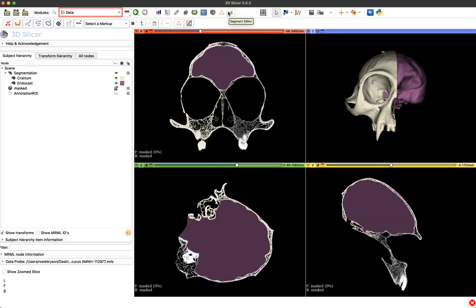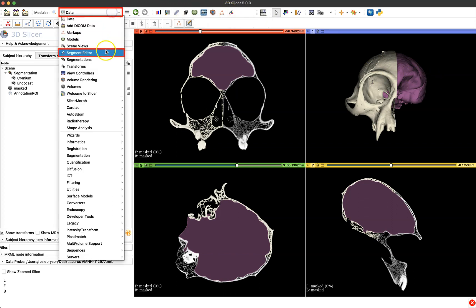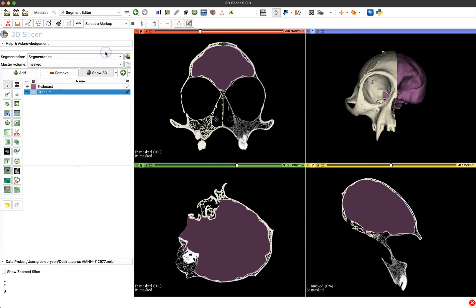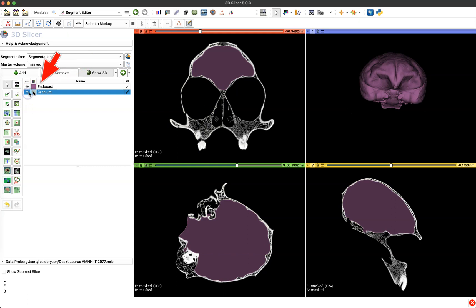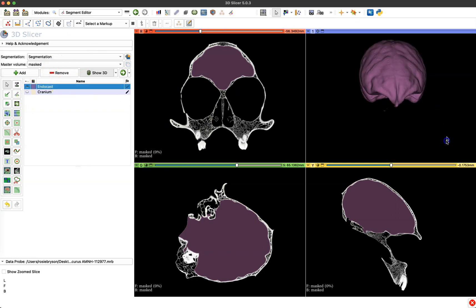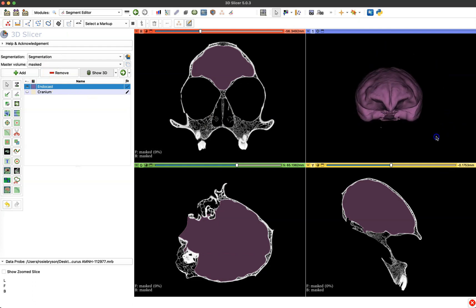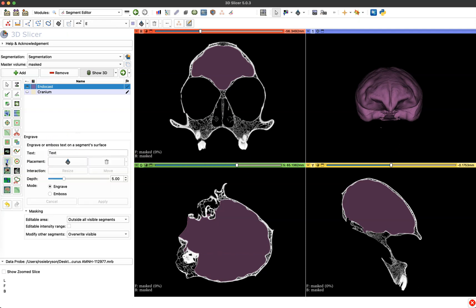So first thing we're going to do is navigate to the segment editor module so you can use that icon or the drop-down menu either way. And once we're inside of that module I'm going to be engraving the endocast today so I'm going to turn off the visibility of my cranium and make sure that endocast is selected to work with. Then I'm just going to click on the engrave tool to the left and once we're interacting with that tool the first thing you do is just choose the text that you want to be putting as your engraving or embossing as your label on your model.